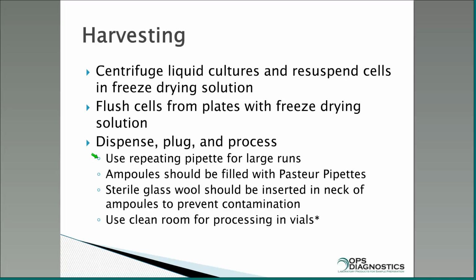They're very good for doing multiple samples. We did a project last summer where we did almost 400 different strains of a bacteria, and we would have gone nuts trying to do that with a regular pipette or even a micropipette. So some tools are really helpful.